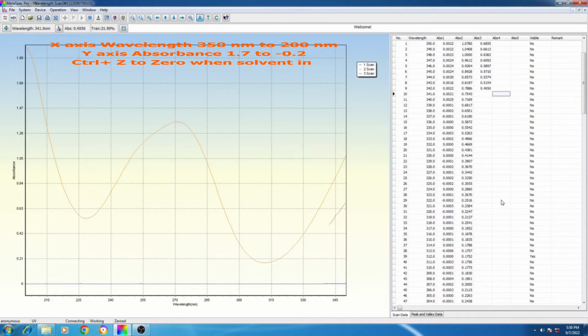As you can interpolate from the graph, the strength of the second concentration is slightly less than the first one, and correspondingly you are getting slightly lower values for the second spectrum.